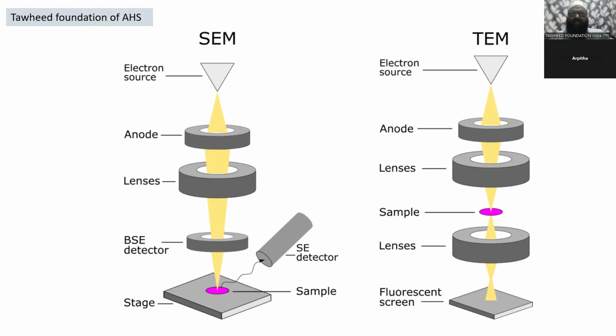In a compound microscope, you are preparing on a slide, whereas in transmission electron microscope or scanning electron microscope, the specimen needs to be prepared on a very thin glass film, like your cover slips. It has to be prepared on that. Ultra thin sections of 20 to 100 nanometers are cut, which are placed on the specimen holder.